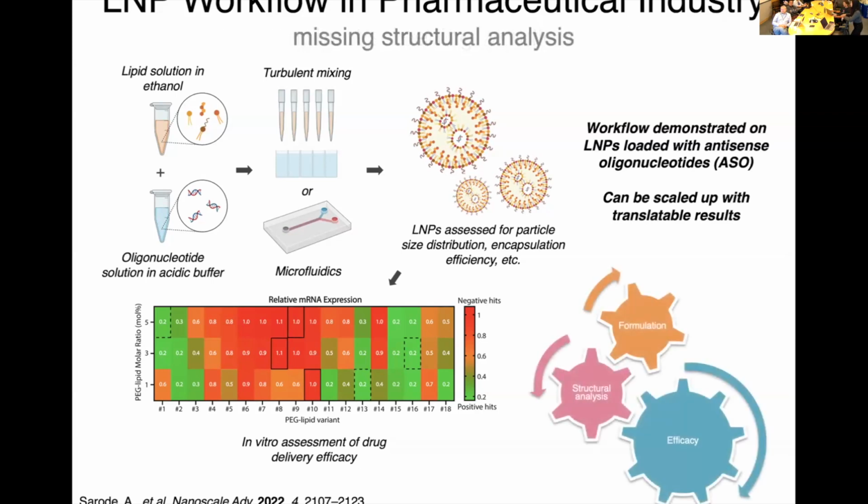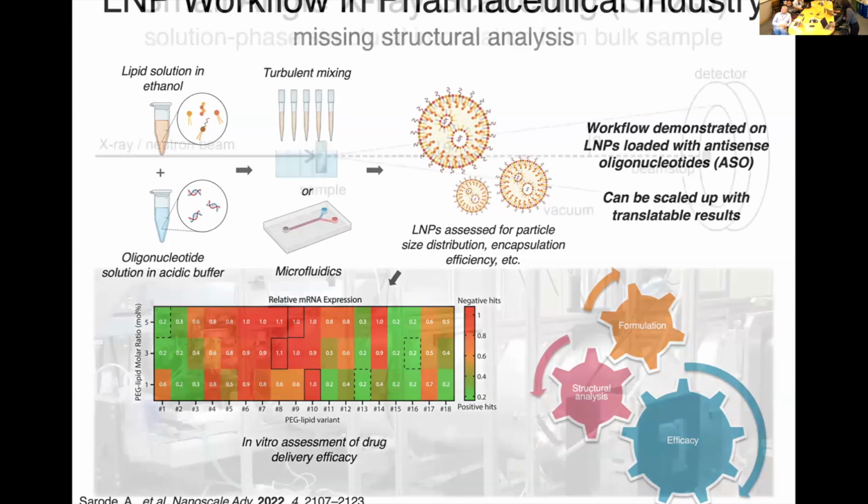But as I mentioned earlier, with all three gears working together, they're lacking that structural analysis component in this high throughput screening workflow. So that's where we come in, as a beamline and me as a collaborator with industry, trying to supplement their current working pipeline with that essential internal structure data.